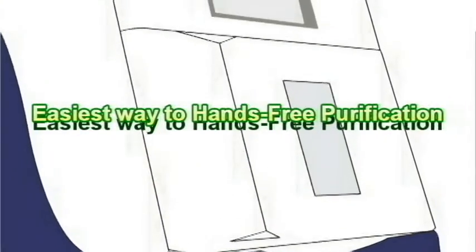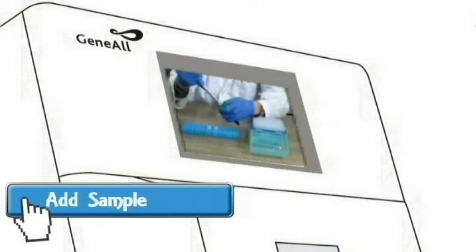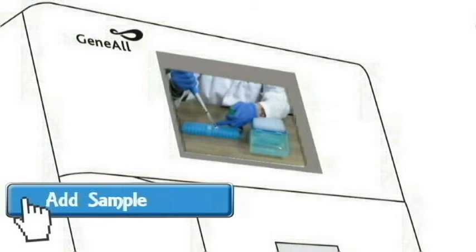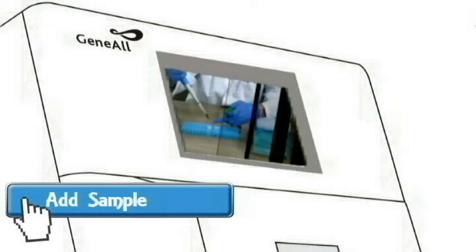Steady offers the easiest way to hands-free purification. First, add samples onto the rack. For blood samples and buffy coats, simply follow the pretreatment guideline.